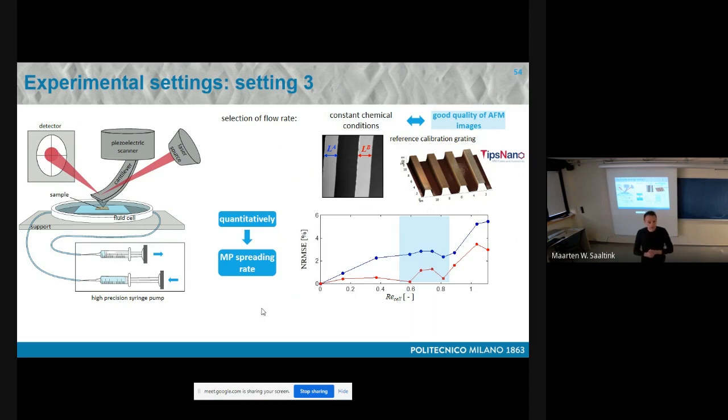And we still don't know how it works, in the sense that there are still people training in using it. And hopefully within next year, we're going to use the combined atomic force microscope and Raman capability to come up with real-time measurements of chemical concentrations in the solution.